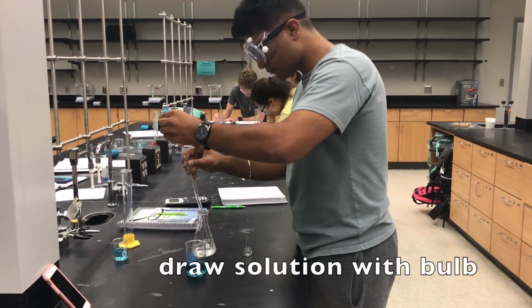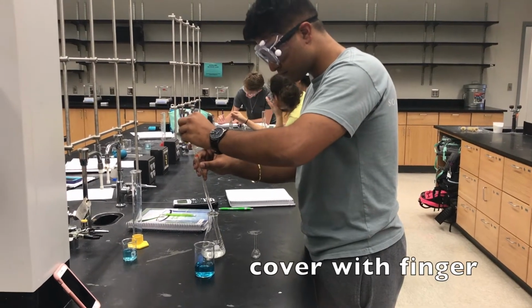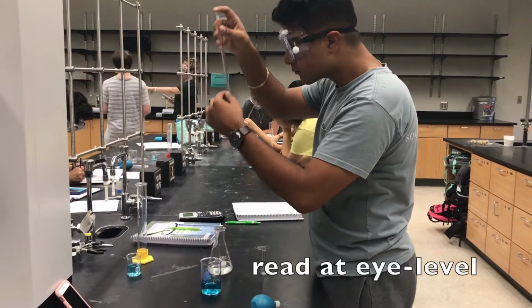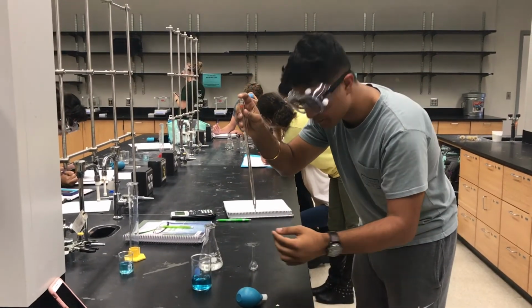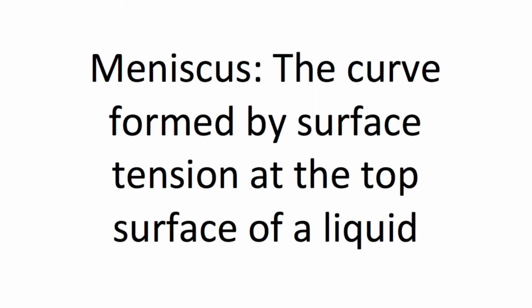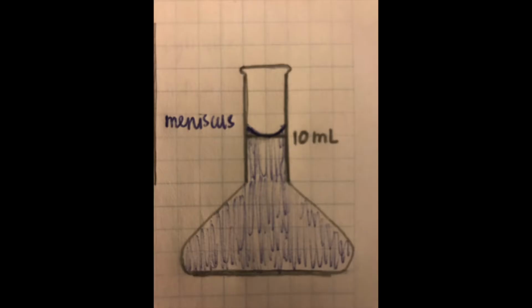Place the bulb on top of the pipette and squeeze to draw your solution, careful to not draw in air bubbles or any into the bulb. Then remove the bulb and quickly place your finger over the top of the pipette. At eye level, read the initial volume of the solution in the pipette. This is done by reading the bottom of the meniscus, or the concave curved line formed by the solution due to adhesion and surface tension at the top of the liquid.